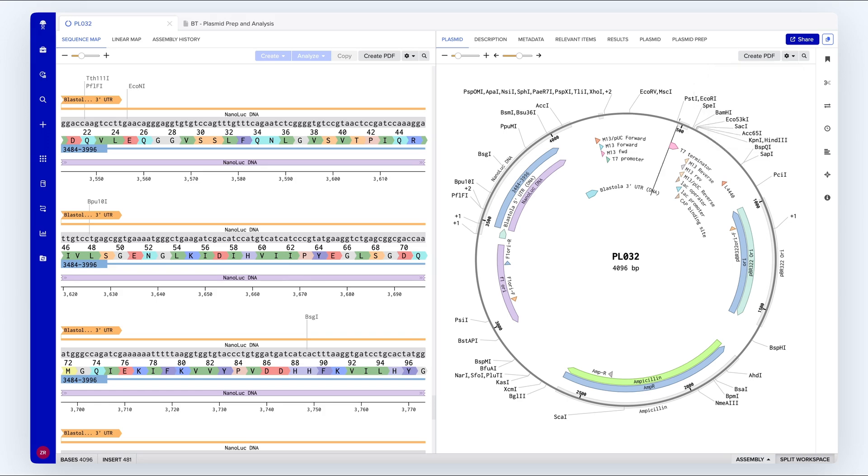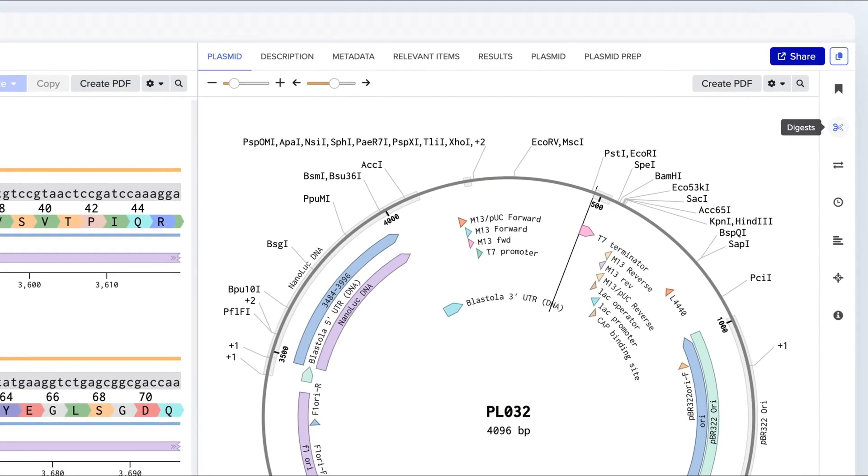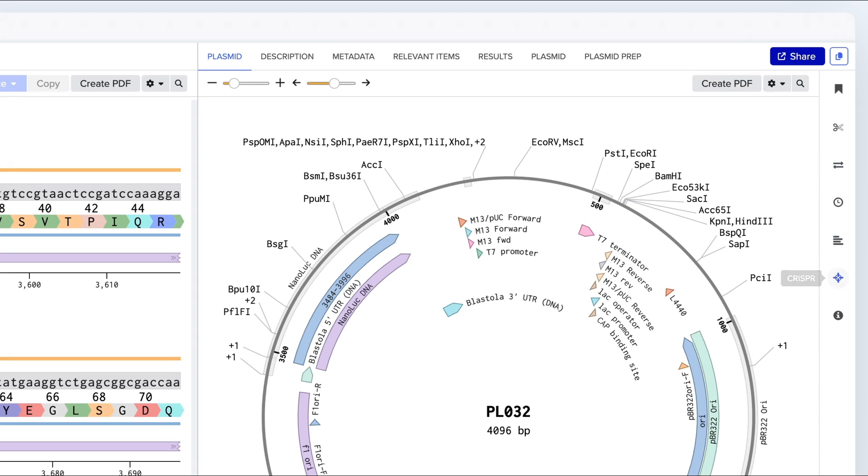On the right-hand side here, we can also access a suite of sequence editing and analysis tools such as primer design, in silico cloning, alignments, and digests.